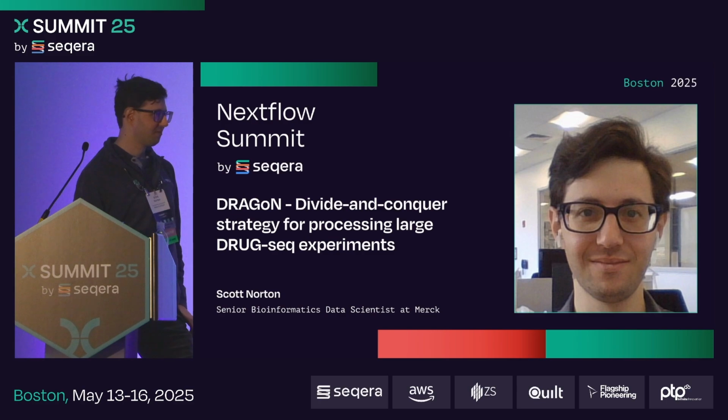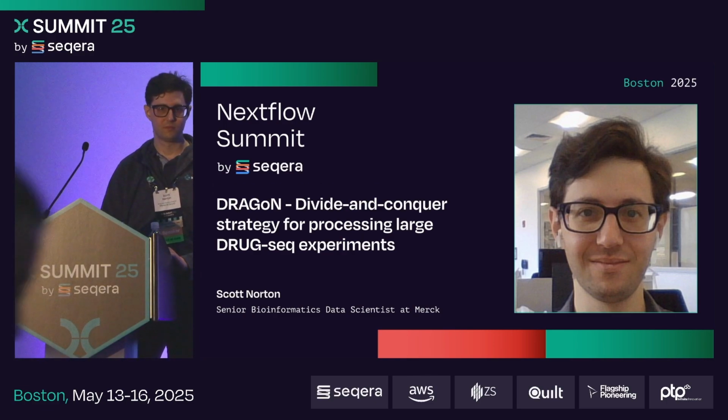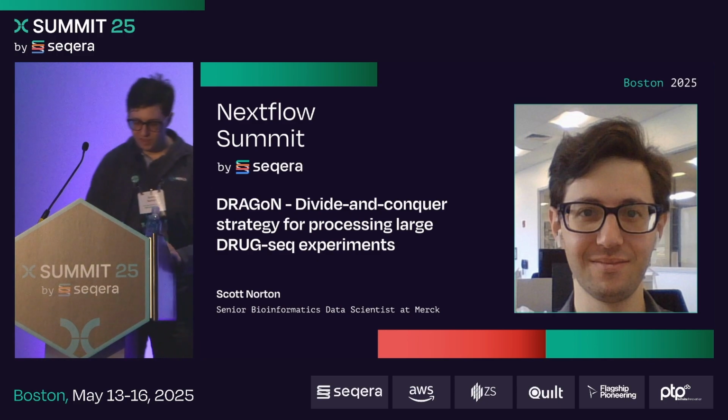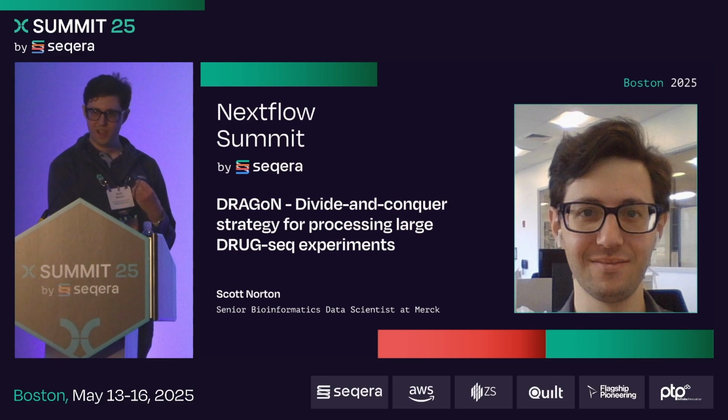Thank you. Do we have any more questions in the audience? So I just wanted to get your thoughts on the increasing prevalence of these types of UMI tags for drug compound libraries and combinatorial chemistry. Do you see this as a major feature in terms of the way large-scale screening gets done moving forward? I mean, the UMIs are usually to correct for biases that might be introduced during the library amplification step. So I do see it as a net benefit. Perhaps we need more robust tooling for handling UMIs. And to the credit of the community, UMI-tools is fairly robust at handling these kinds of data sets.